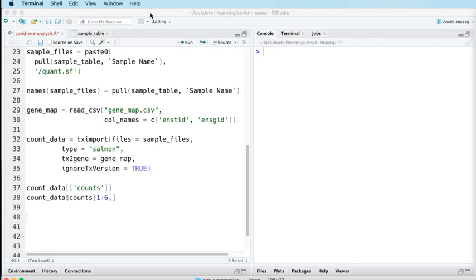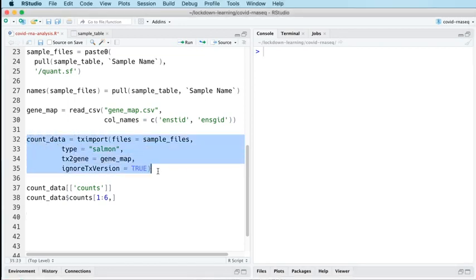Okay, so yesterday was another one of those days where essentially we spent an hour writing one line of R, really. So we spent the hour yesterday getting our count data from the files produced by Salmon into our R session using the library tximport, which we talked about briefly last week and maybe in a little bit more detail yesterday. So tximport takes the data that's in those files, interprets it and reads it and gets it into R, into a data structure in R, which we can then use within our R session.